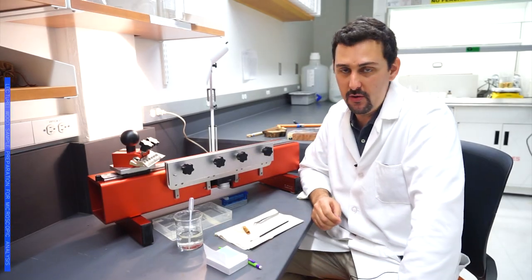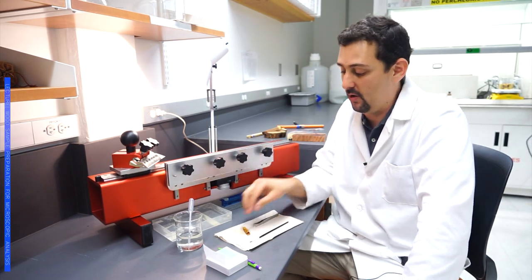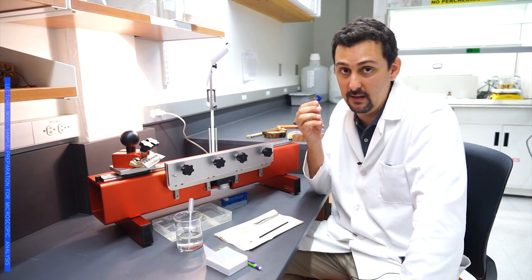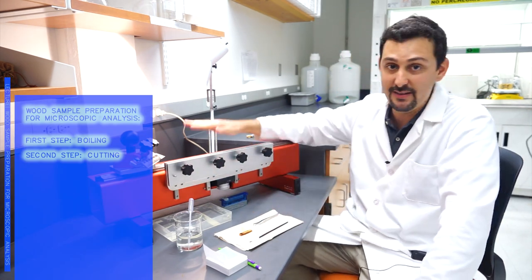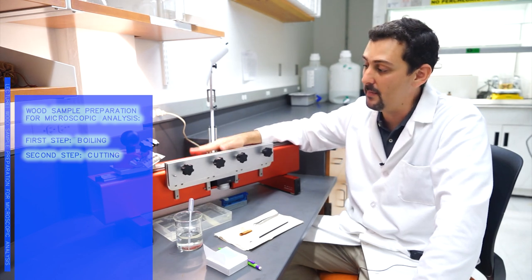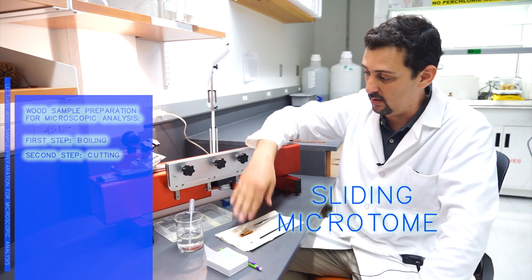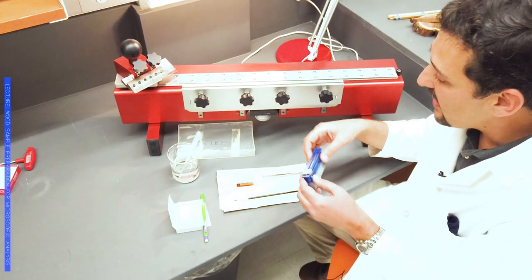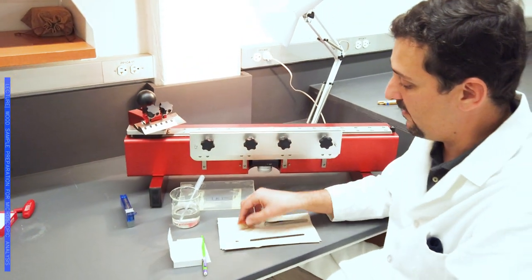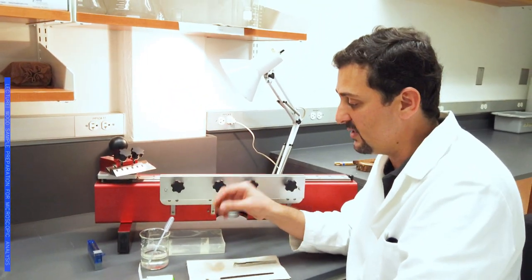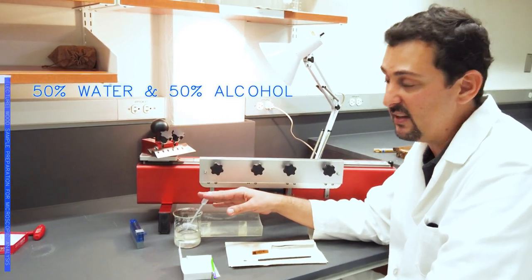Now I will show you the basic tools and instruments that we use to start our process of getting anatomical cuts from the wood. First of all, this big machine that you see here is what we call a microtome. In this case, it's a sliding microtome. We will put our sample on this platform here. Normally during the cutting process, we will just use a mix of water and alcohol 50-50.